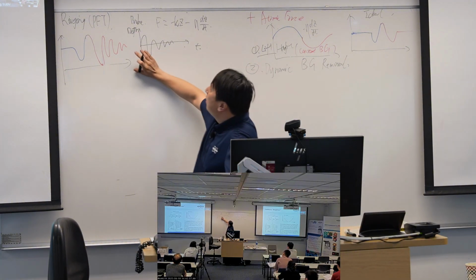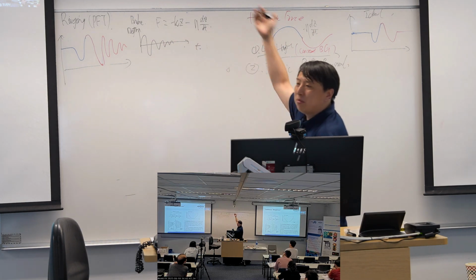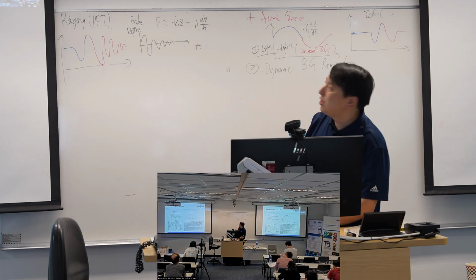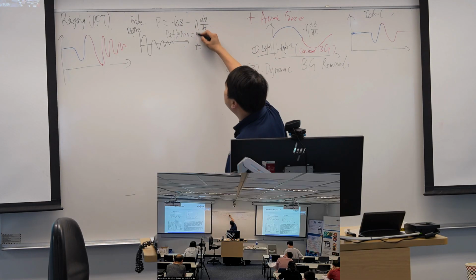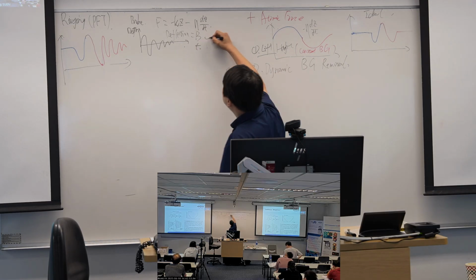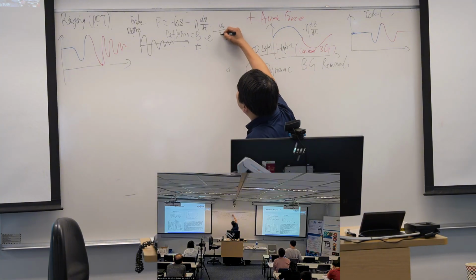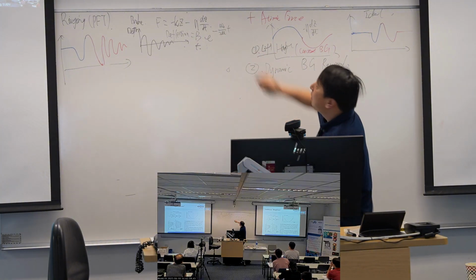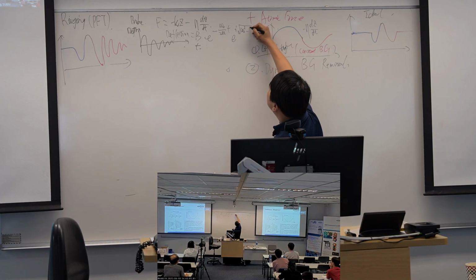So from this curve, if we remember the morning's function, the deflection equals a certain amplitude times e to the power of minus omega 0 divided by 2Q times t, times another part, e to the i times the square root of omega 0 squared minus omega 0 divided by 2Q, times t.